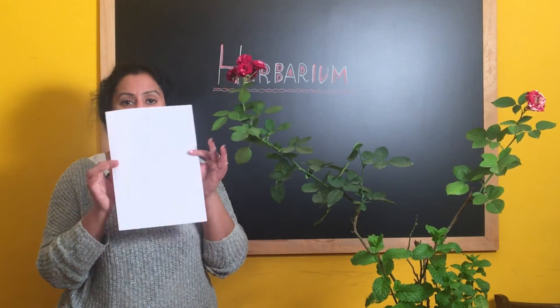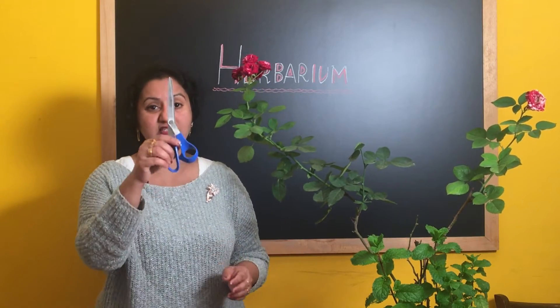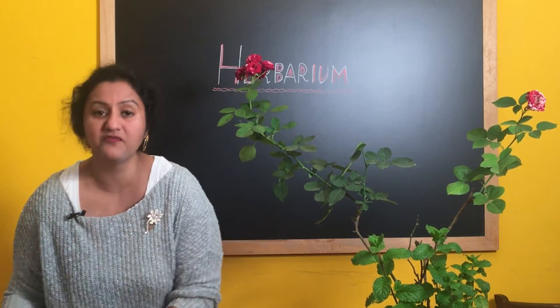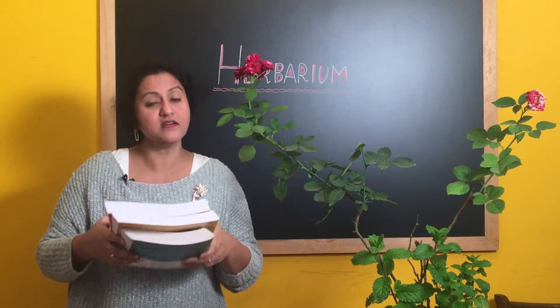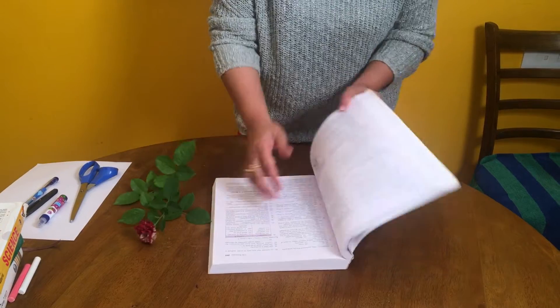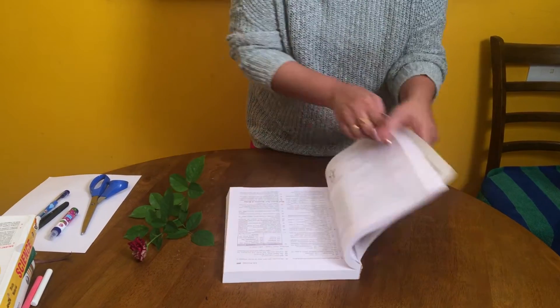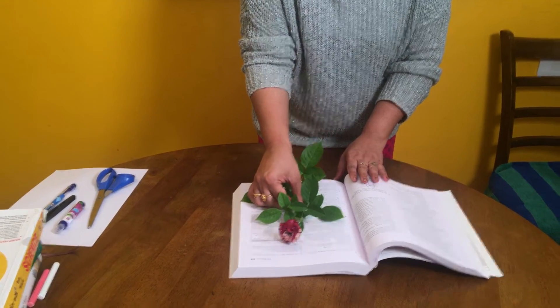We need an A4 size paper or a chart paper, a glue stick, scissors, forceps, a pen and few thick books which help you in pressing the specimen. I have taken a very thick book because I need to press the branch with the leaves and the flower.